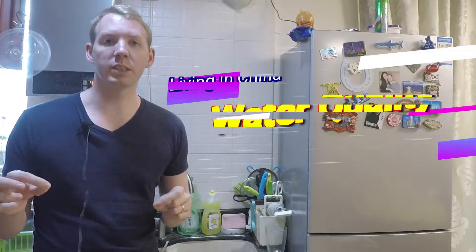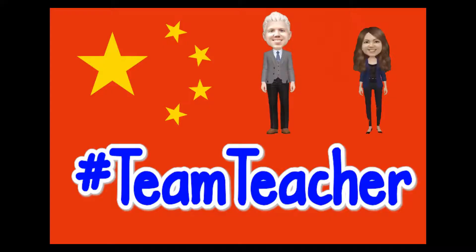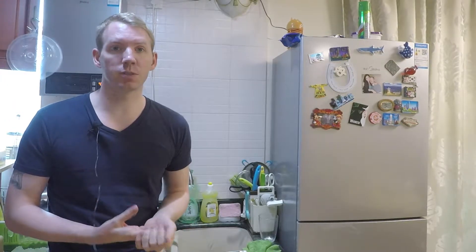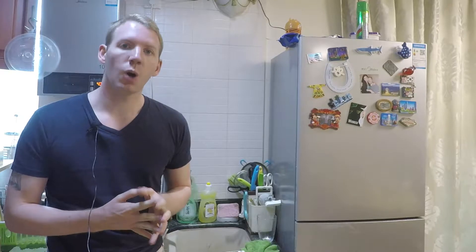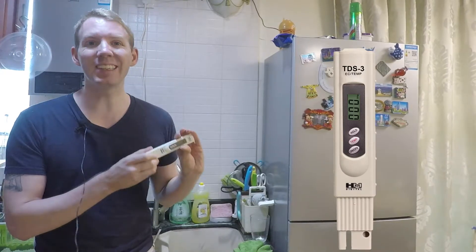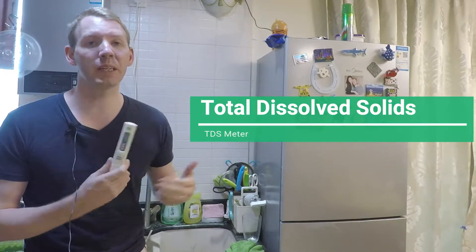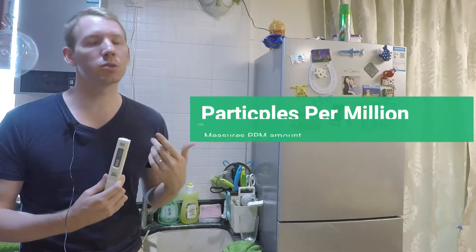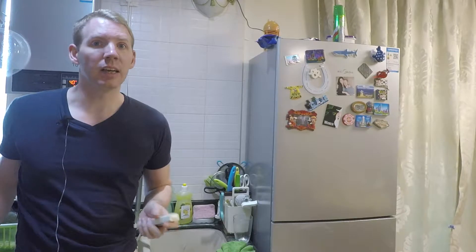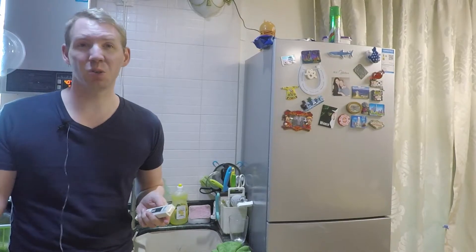How do we know the water quality that we receive from the tap water in China? Often this information is very difficult to find out and there are multiple ways. One way that we've actually used is a TDS meter. TDS stands for total dissolved solids and it measures the particles per million in the water, with the idea being that the higher the level of particles, the more risk it is to your health.